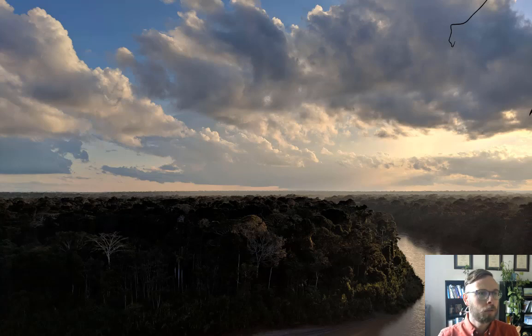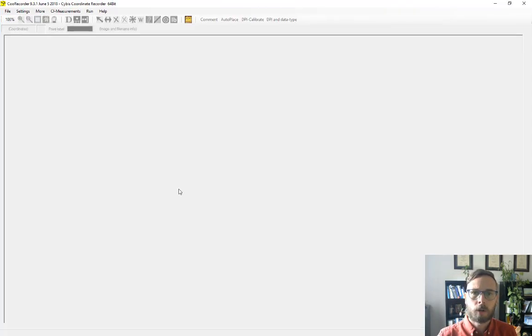This is the newer version of Coorecorder as of June 2018. This is 9.31. You may have a slightly different version on your machine, but in general, most of the things will be in the same places.